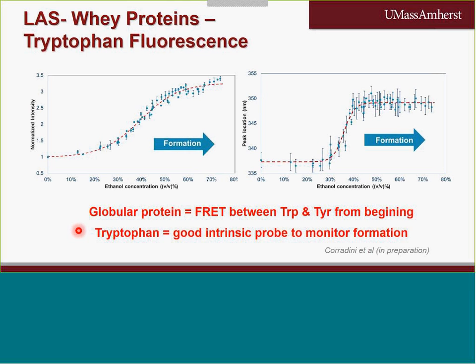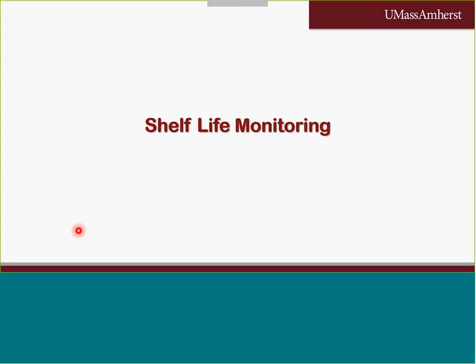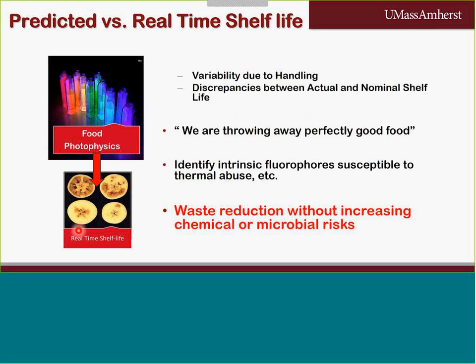Shelf life monitoring: using spectroscopy in order to evaluate variability and handle discrepancies between actual and nominal shelf life.